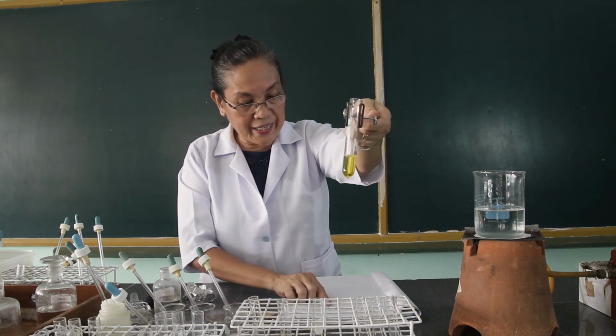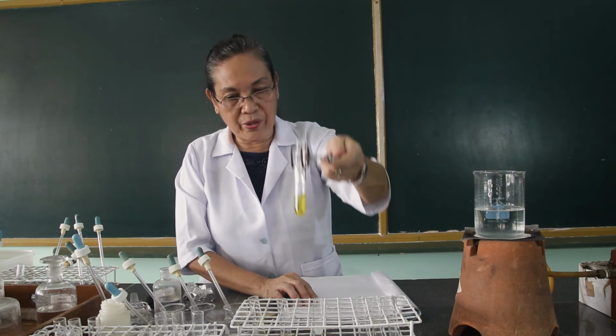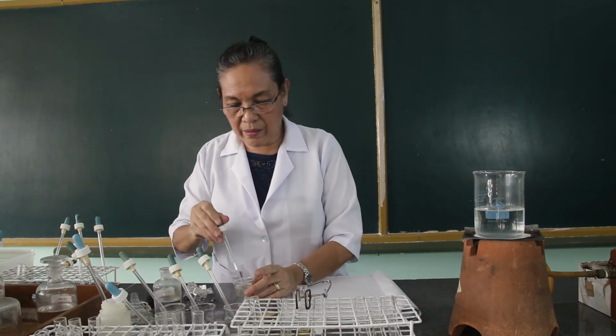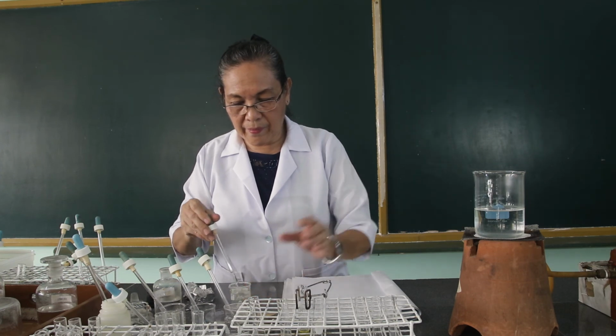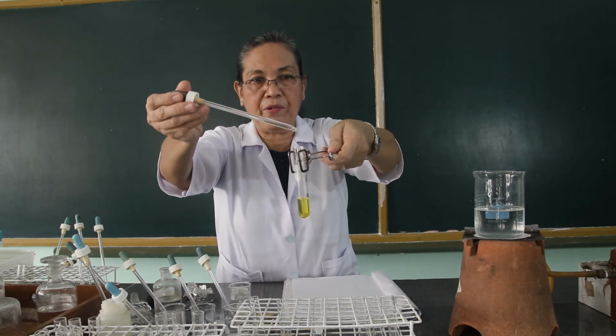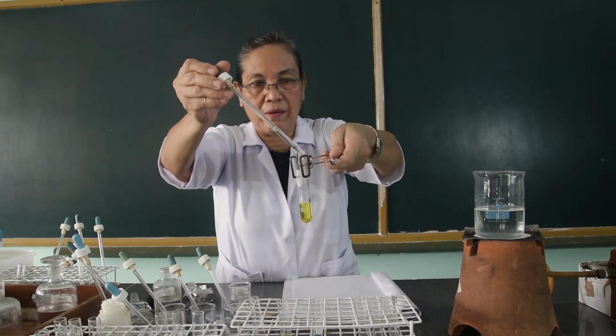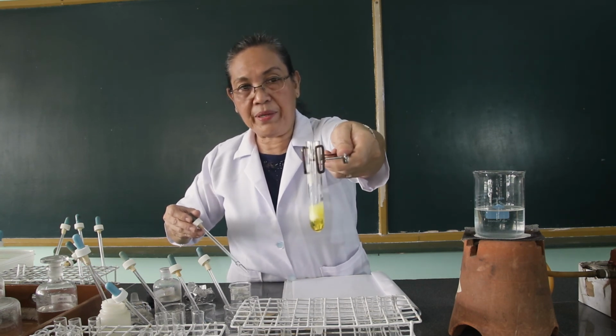We will add this with ammonium oxalate, and I want you to observe. Let's add 5 drops of the ammonium oxalate. Observe what happens.